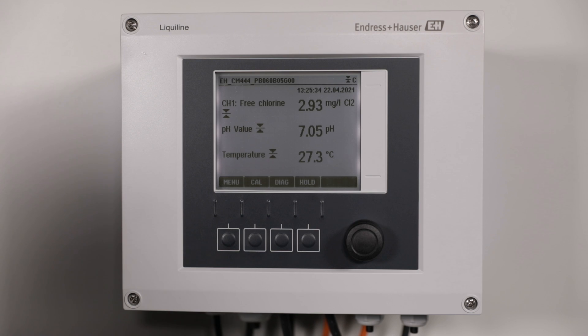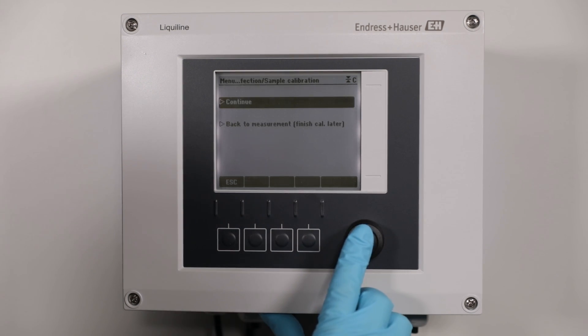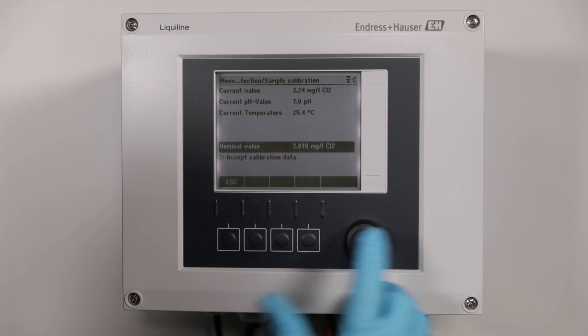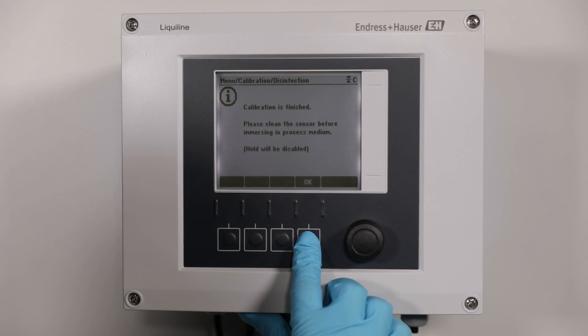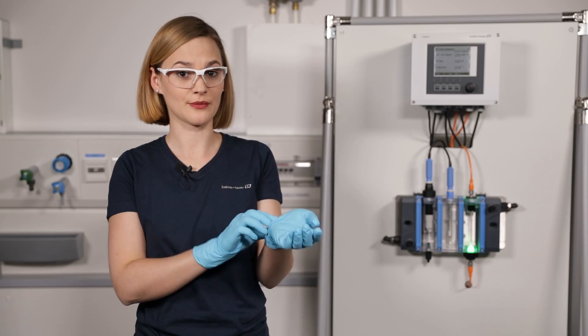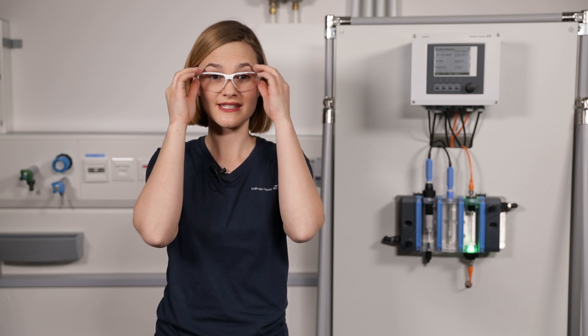You made it! Enter the value from the photometer into the Liquiline transmitter. The calibration data is now stored in the sensor head, which allows you to use the sensor anywhere with its current adjustment. Another good thing about Memosens data is that whenever your DPD measurement failed and wrong calibration data is stored in the sensor, you're always able to restore the factory calibration. So it's foolproof.